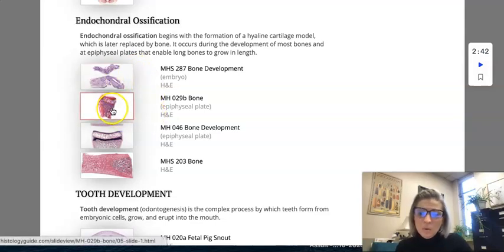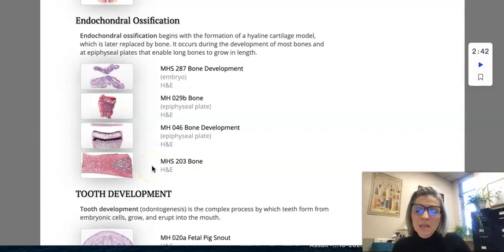When you see this epiphyseal growth plate, and this one, and probably even this one down here, we actually see both primary and secondary ossification for our endochondral ossification. Okay, so a lot of words. So let's come up here first to this one.